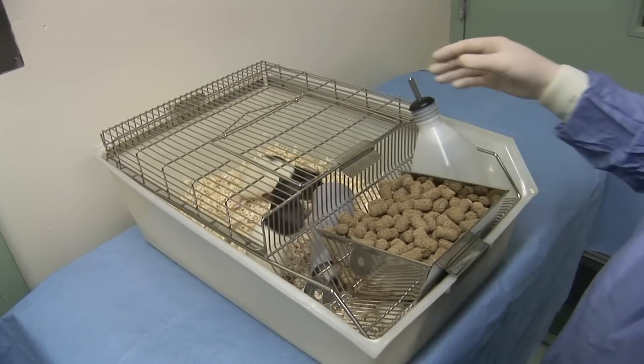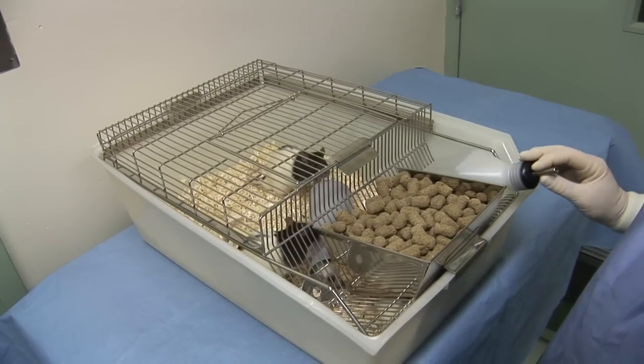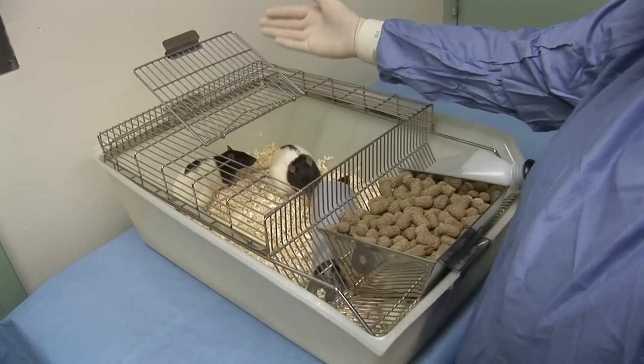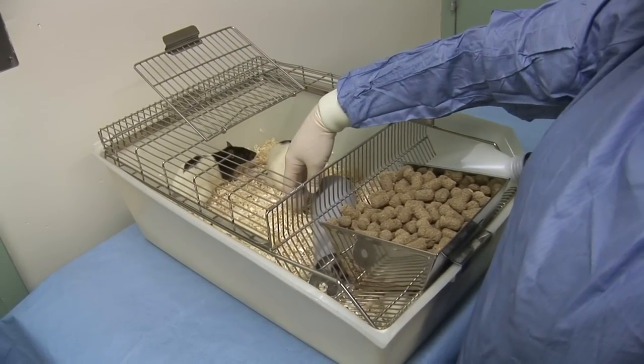The cage top should either be opened or carefully removed to avoid excessive disturbance to the animals. The rat should be allowed sufficient time to become aware of your presence.